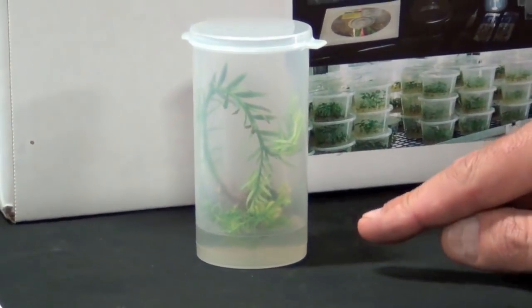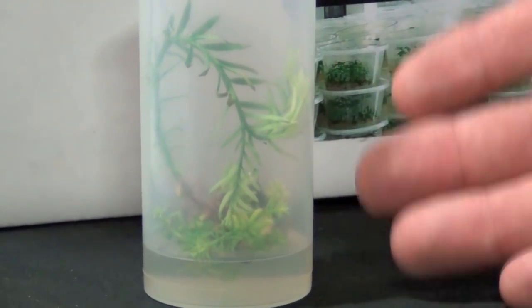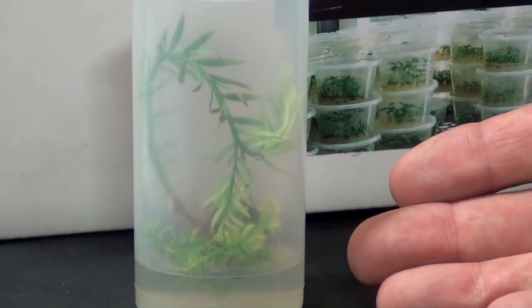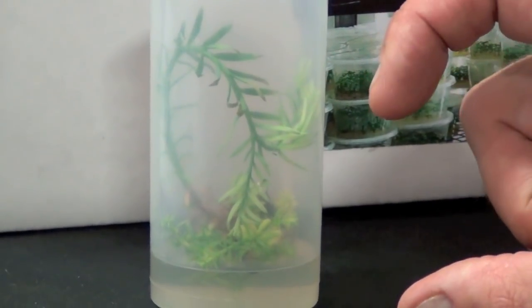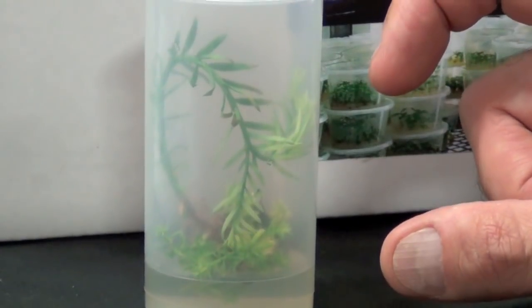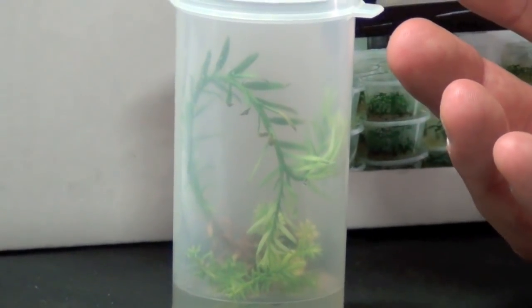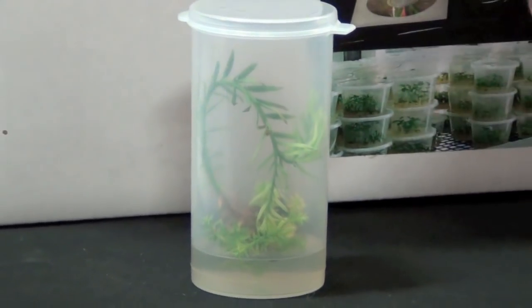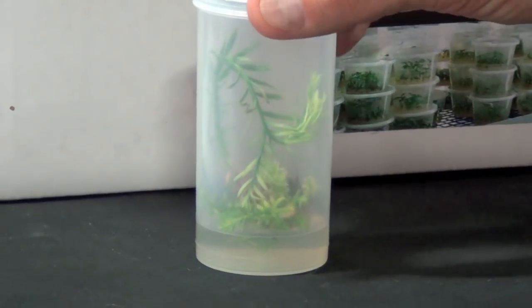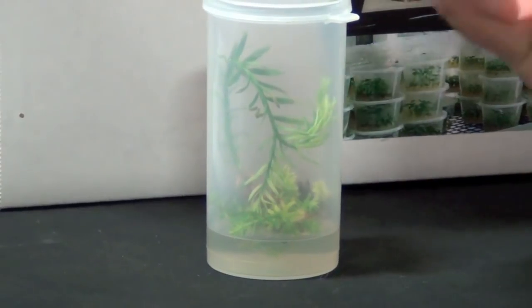What we're doing is we're growing the plant using regular nutrient and vitamins like everyone's used to, but we're also adding sugar in here. Sugar is going to give this the energy to grow. The hormone — in this case a branching hormone — is going to give it a direction. I want it to not grow roots, but to give me lots of tops. This is a cytokinin, which is the opposite of a rooting hormone. The cytokinins are going to keep the plants short, keep the nodes tight, and prevent the growth of roots — so I'm going to have a lot of branching, and those branches are all going to be new plants.